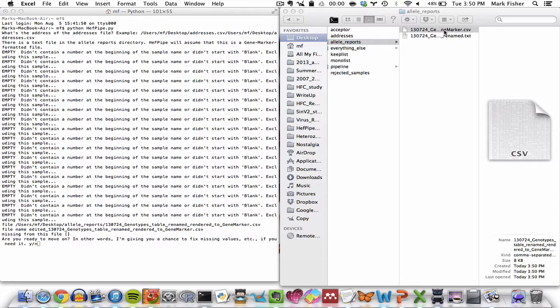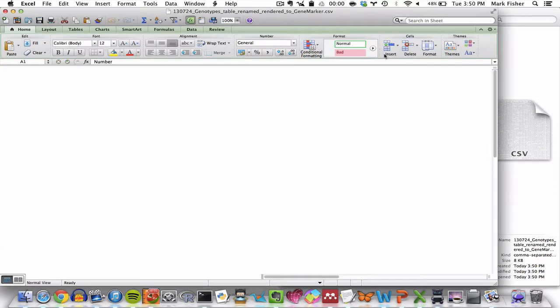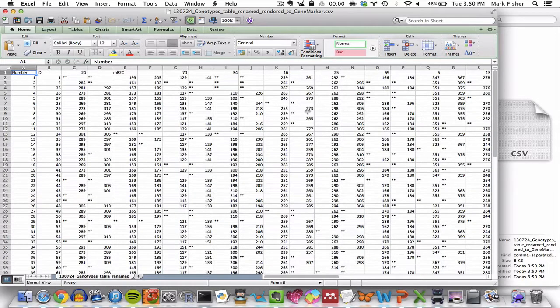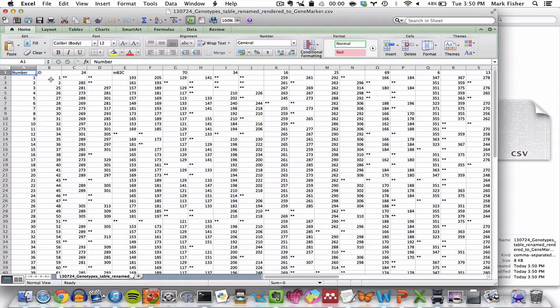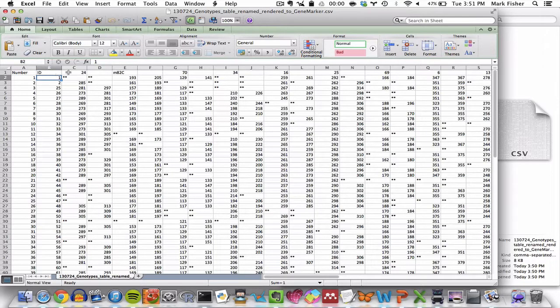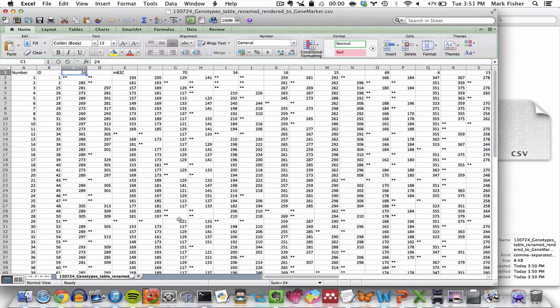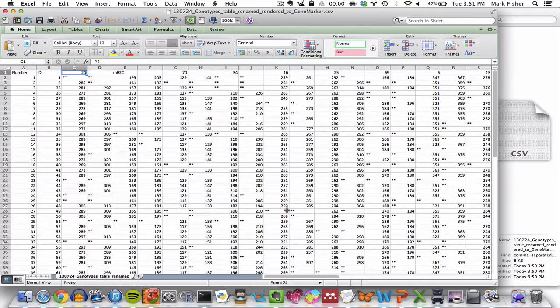Let's take a look at what this looks like. And you can see all the sample names are in this column. All the locus names, all the marker loci are in the first row. And all the genotype information is in the rest of the file.